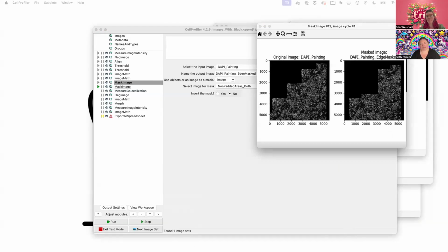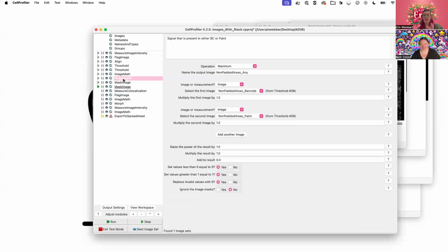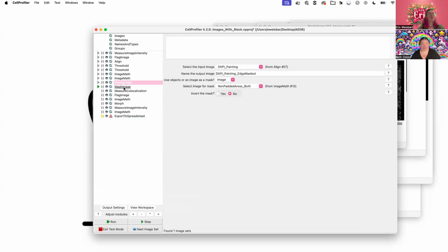Yeah. So then why did we make the mask for that one? Or are you going to show us later? The mask for the "in any"? The larger pipeline that I pulled this from does a whole lot of other measurements. Here I left it in mostly just to show people here is another simple way that you could generate this mask and information. I do not actually use it in this little demo pipeline. But one could.